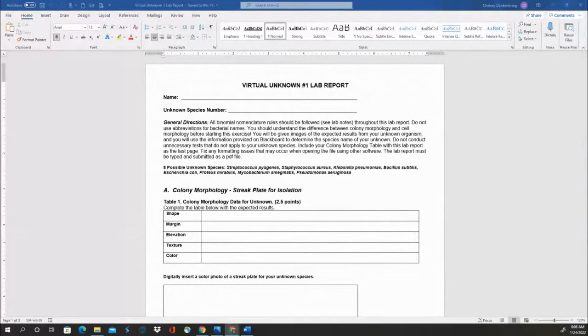Good morning, everyone. This video is going to walk you through how to complete your unknown number 1 lab report. It is posted under Lab Unit 1 in the unknown number 1 folder. So essentially what's going to happen is I'm going to email you with the number of your unknown, which you will record on this sheet.